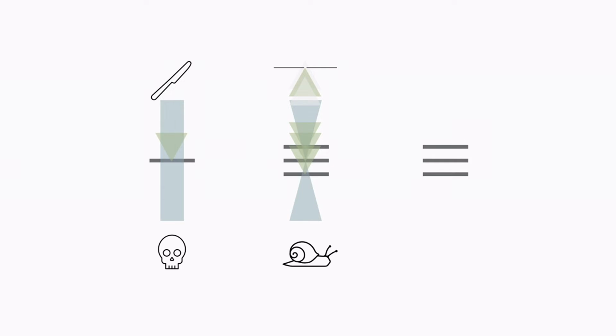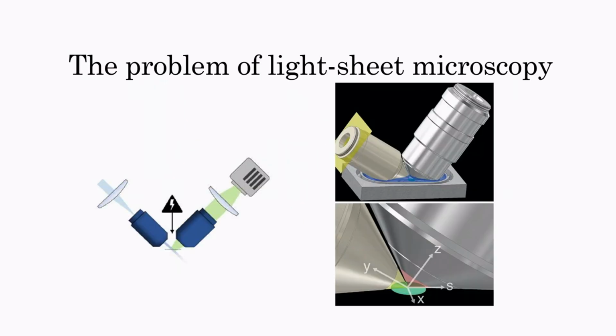And the gold standard for this type of imaging is usually light sheet microscopy, where you come from the side and you image orthogonally to that. The problem there is you have 2 objectives, and that can be troublesome if you have a sample that is bigger than the volume you want to put this into. And if you want to look at mitochondria, you need really high NAs, but at the same time, we have a really big sample. So we have trouble fitting it in there. So we decided to take the idea of light sheet microscopy and combine it with multifocus microscopy.